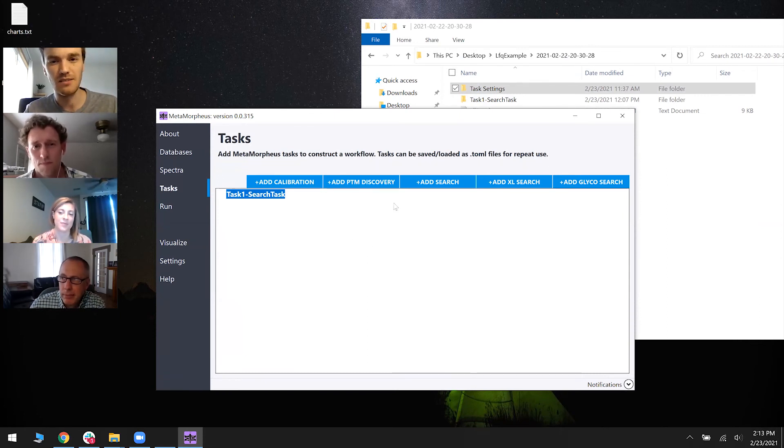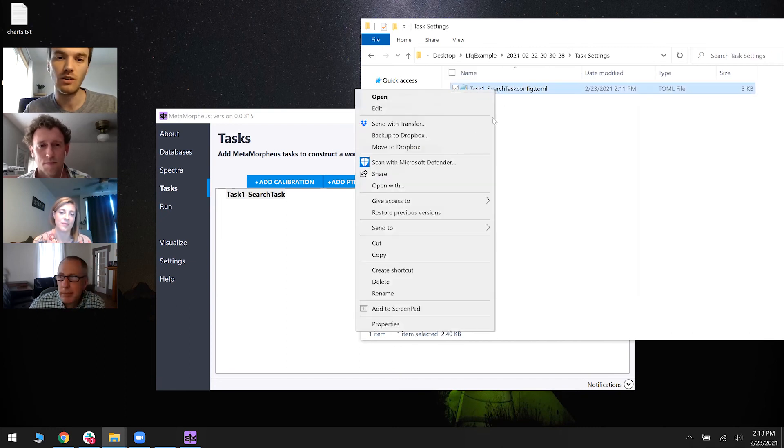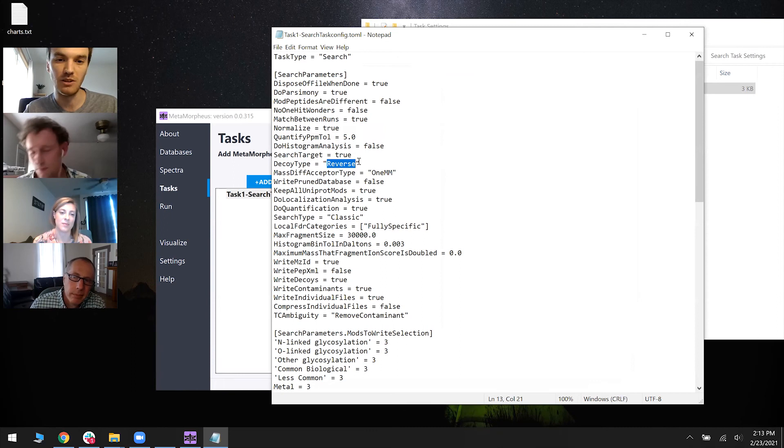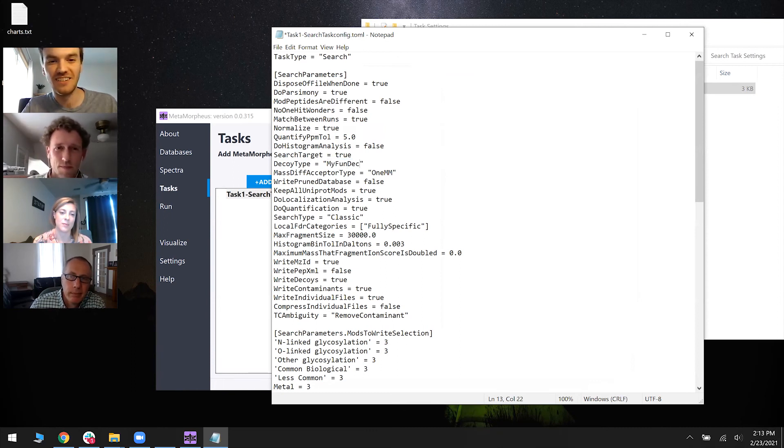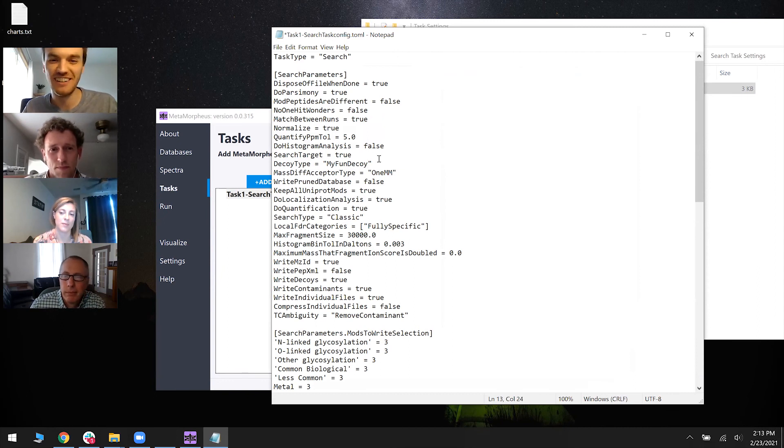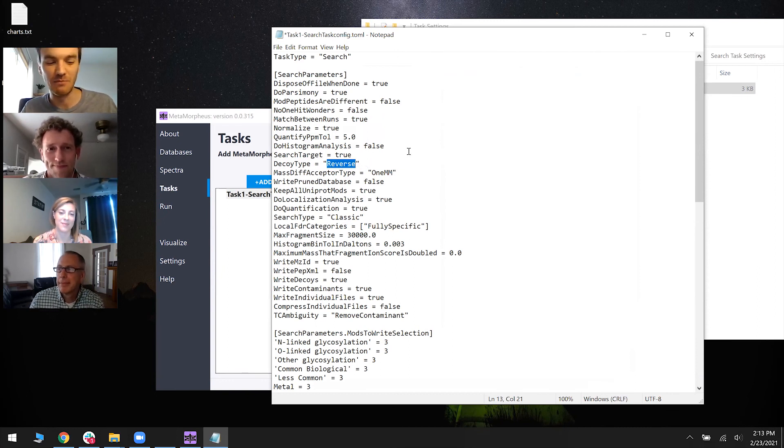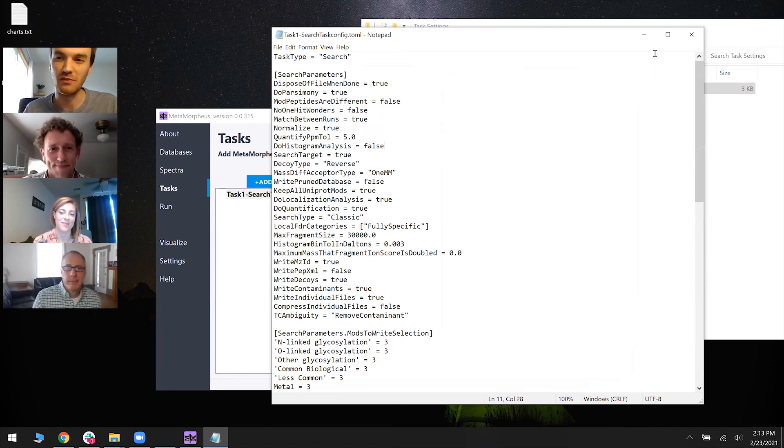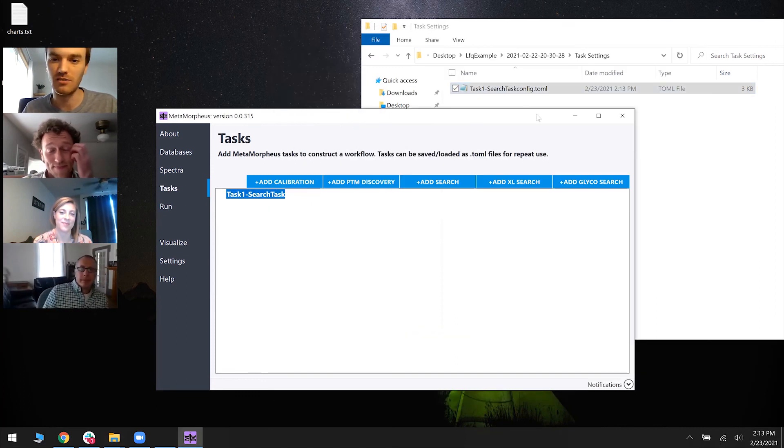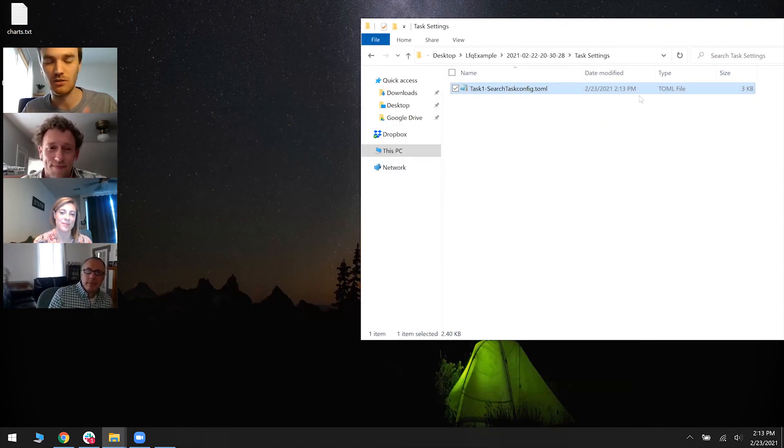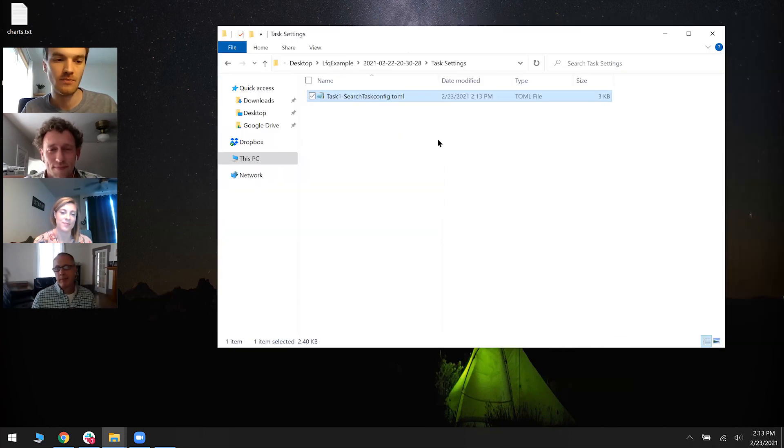Because, you know, editing these TOMLs, you can break stuff. Like if I made this decoy type to be something else, MetaMorpheus would not run properly because that's not a valid decoy name. So just to make sure you're doing stuff right, I think it's usually better to make stuff in the GUI and then transport that to the command line world.